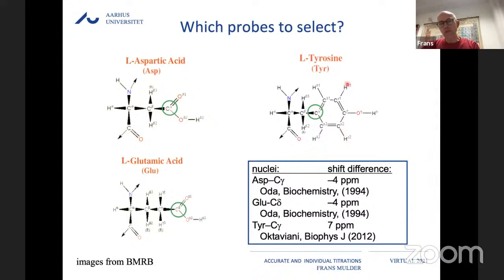Then these chemical shifts are going to be averaging. And if this process happens to be on a millisecond timescale, which is quite common for tyrosine rings, this broadens these signals completely away. So when we applied this to photoactive yellow protein, we could only observe a small subset of the tyrosine residues. So what we then resorted to was taking the gamma chemical shift and correlating that with the beta protons, because the beta proton chemical shifts and the gamma carbons are immune to this rotation. So in such an experiment, we then observed all the correlations.